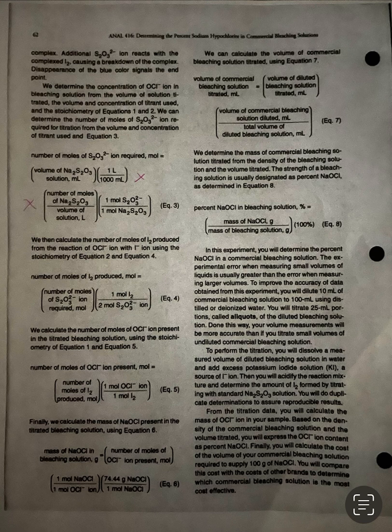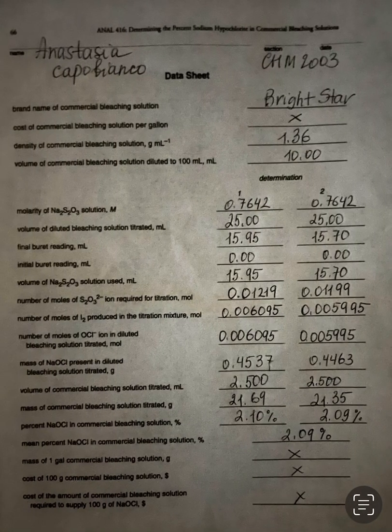Okay, so you got your mass of commercial sodium hypochlorite present in diluted bleaching solution. For each determination, I had a different number because I had a different number of moles of hypochlorite ion.